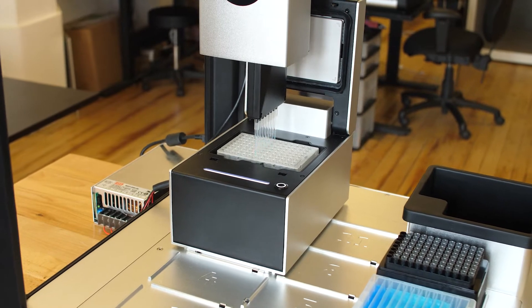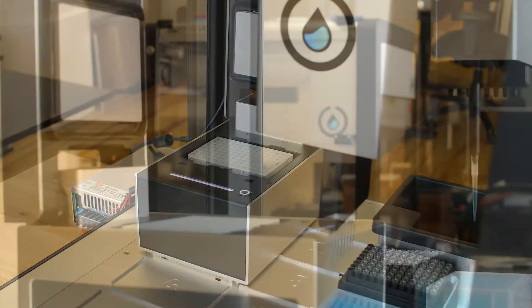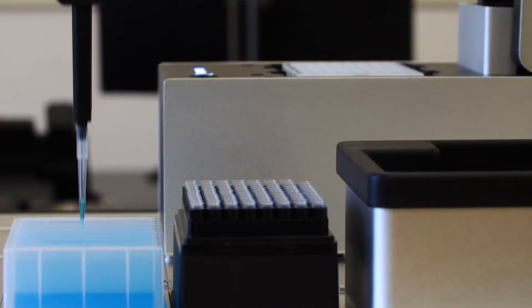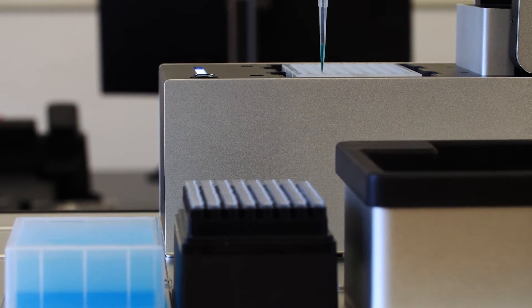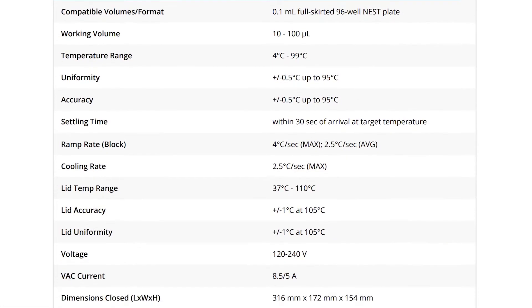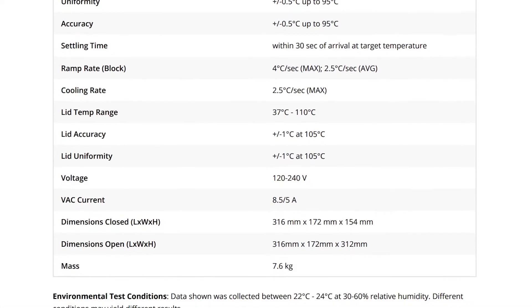The thermocycler also has a fully automated lid and a bright notification light so you can see what's going on in the thermocycler from across the lab. It has some pretty serious tech specs too — it's capable of reaching a wide range of temperatures and has a fast ramp rate for critical experiments. You can find all these specs in more detail on the thermocycler page on our website.